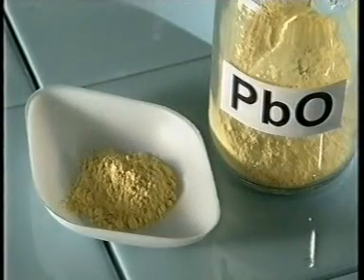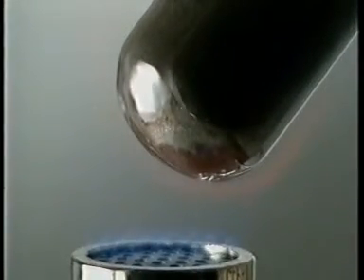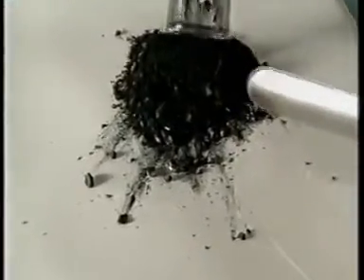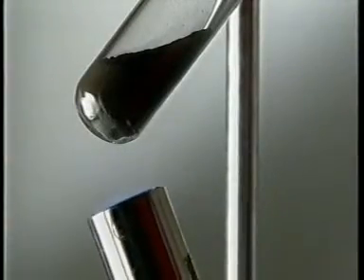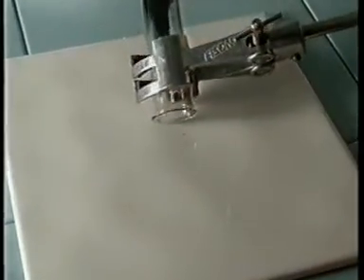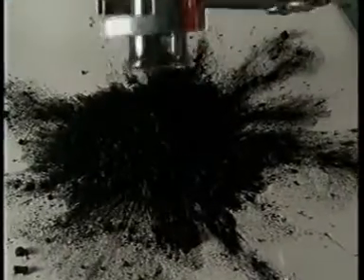So, can other metal oxides be reduced by carbon? A mixture of lead oxide and carbon is heated strongly for several minutes. Beads of pure molten lead form in the tube. But heat a mixture of iron oxide and carbon, and nothing happens. Why does carbon reduce copper and lead oxides, but leave iron oxide unchanged?